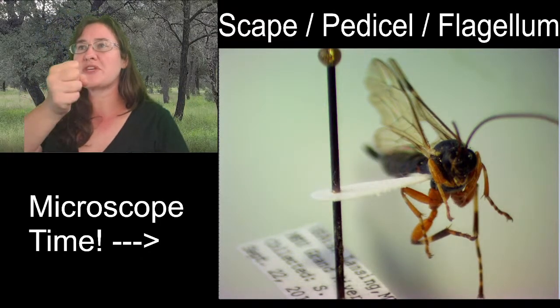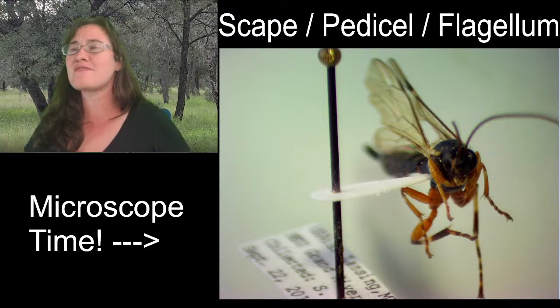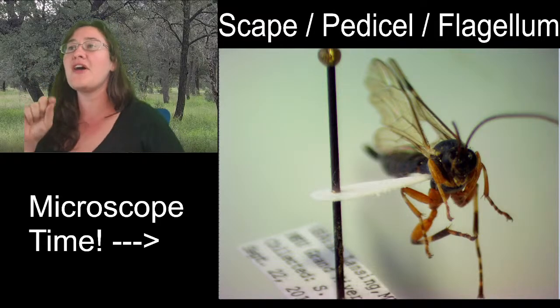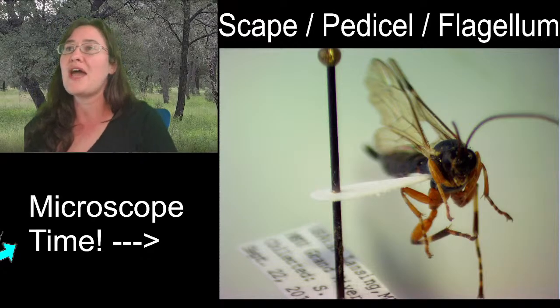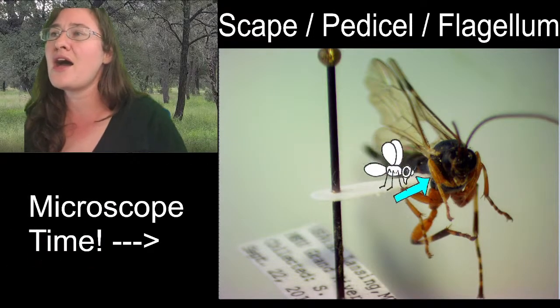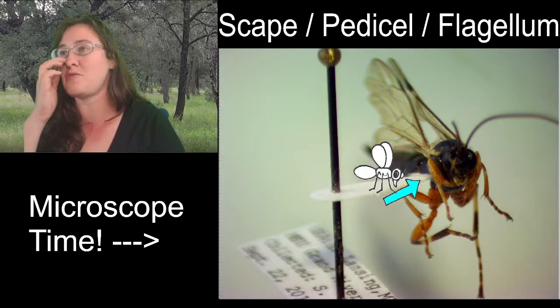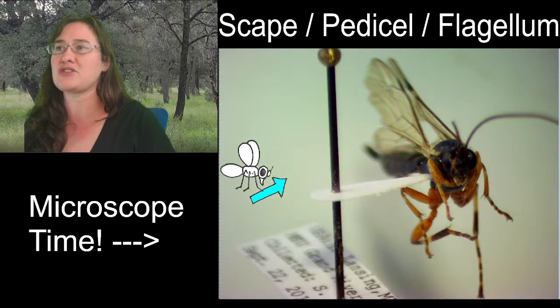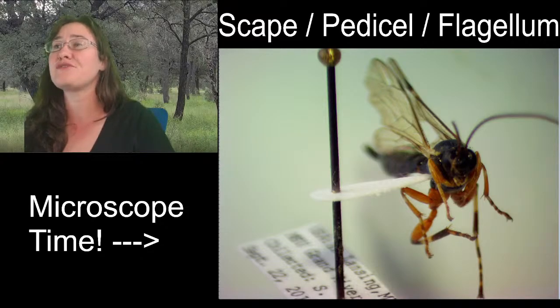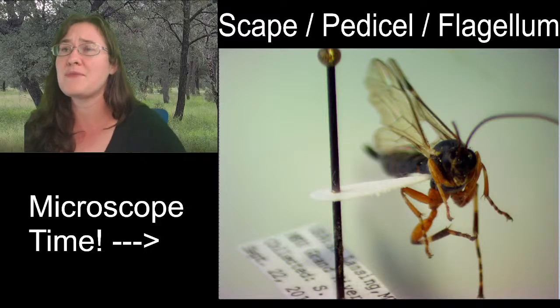So there's actually something that we call a point press, where instead of being like a hole punch with a perfect circle, you punch out points. Then you put a little bit of glue on the point and glue the right side of the specimen to the point, and then the pin goes through the point, and that way you don't ruin any of the characteristics on your specimen. This is done for a lot of very small insects if the pin is going to be too big. It's also done for any and all ants.